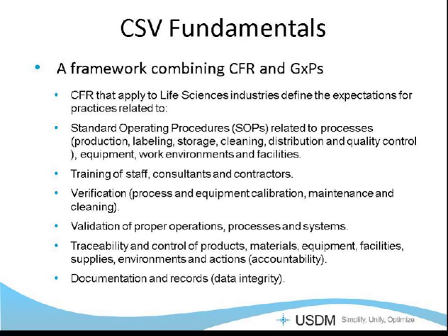The CFRs that apply to life sciences vary from GLPs to GMPs to GCPs to Part 11 compliance. Outside the U.S., we have Health Canada, and the EU Annex 11 and Annex 13. They vary, but in general, they all define the expectations for practices for laboratory systems.